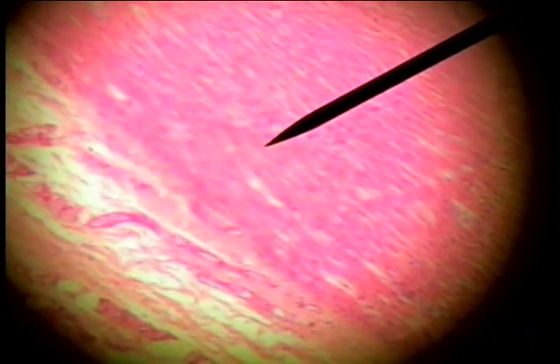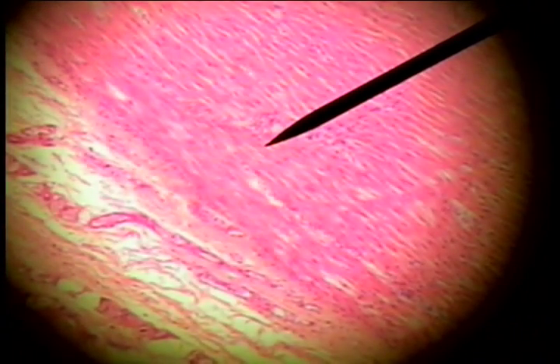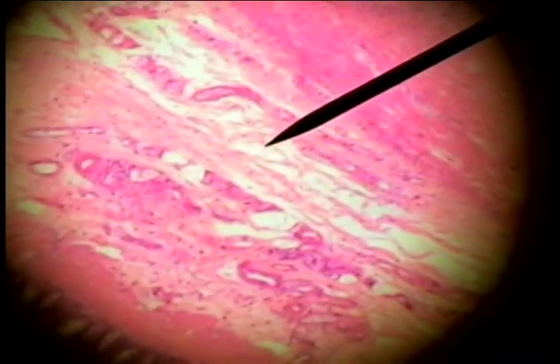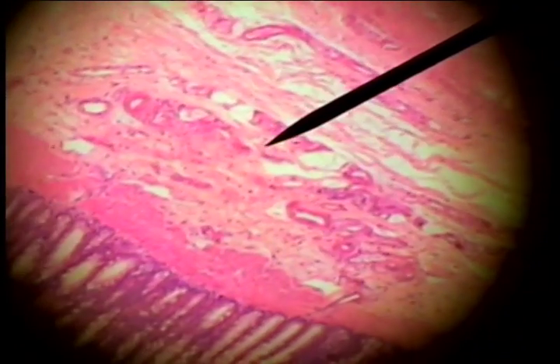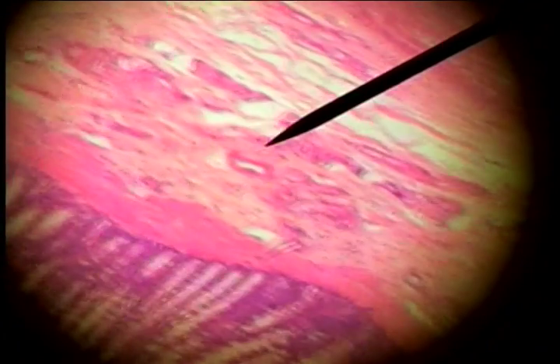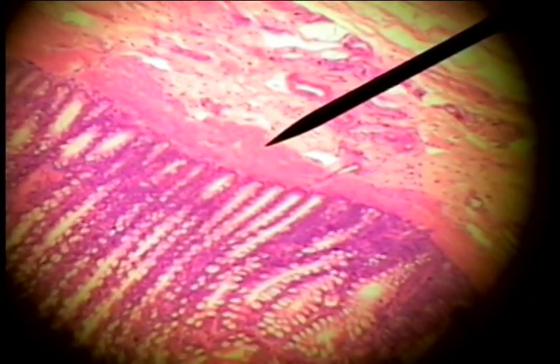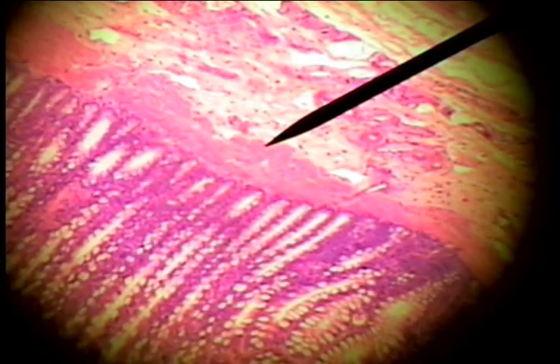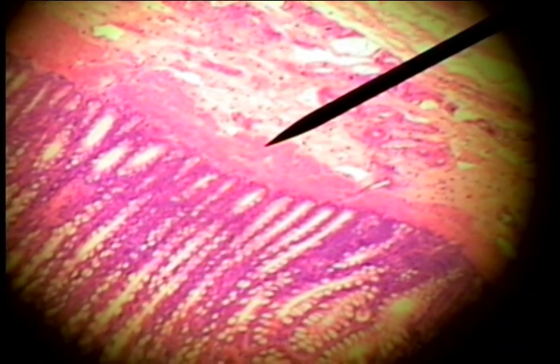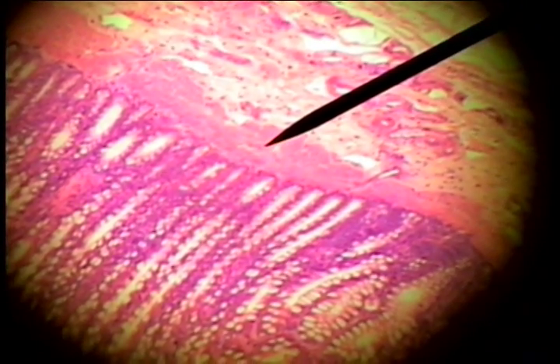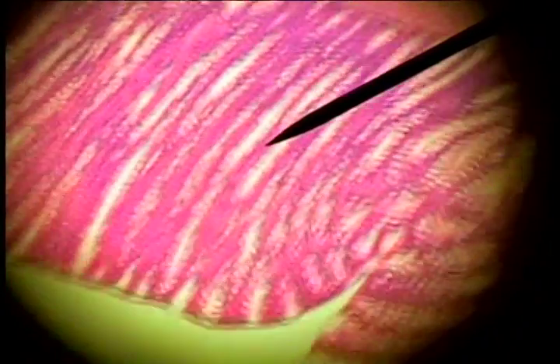And if we go back down to the lower power, here's the submucosa, a looser connective tissue. There's some blood vessels, and then the mucosa with the layers of the mucosa.